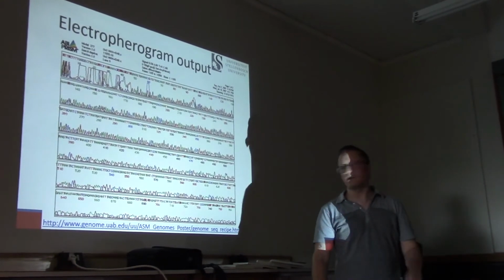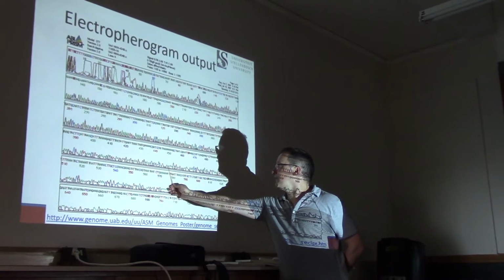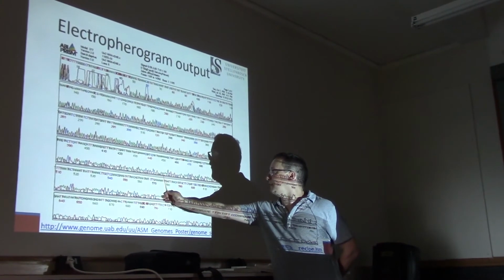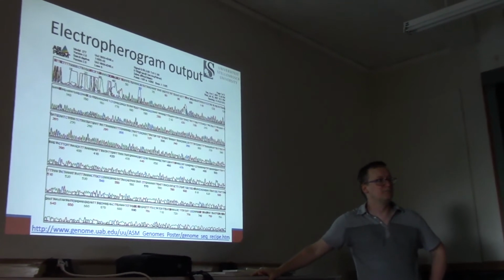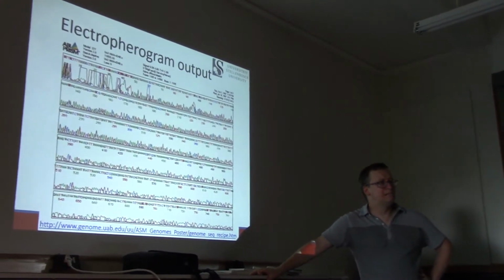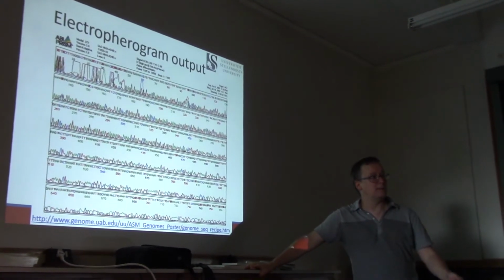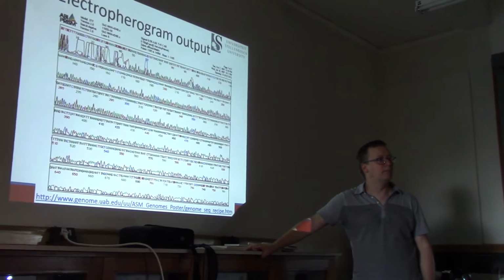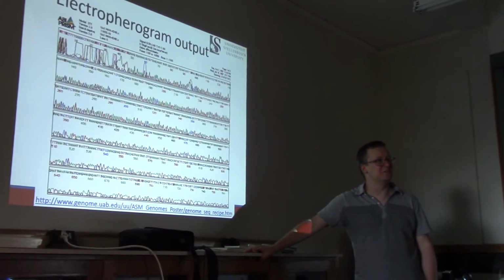And how confident are you going to feel about, let's say, this little nucleotide right here at 450? Okay, I'm claiming that this is a green peak. Therefore, I'm inferring that there's an A there. What's my chance of error associated with that? Are we in coin flip territory? Am I more confident or less confident than a coin flip? No one's really sure on this one.